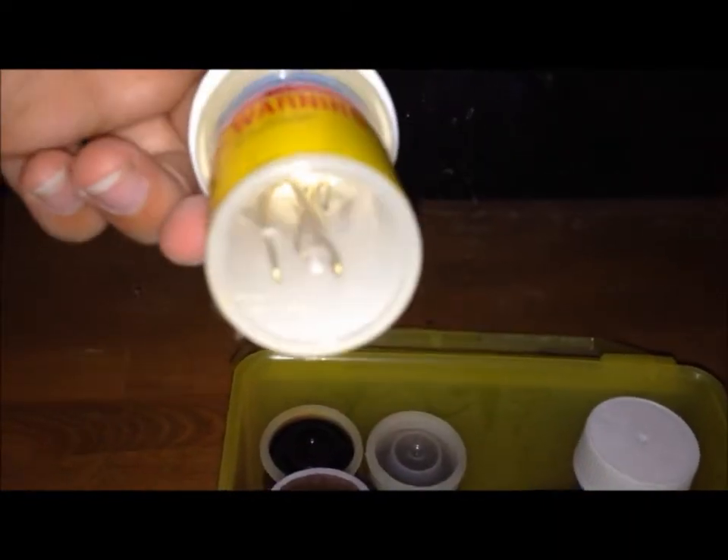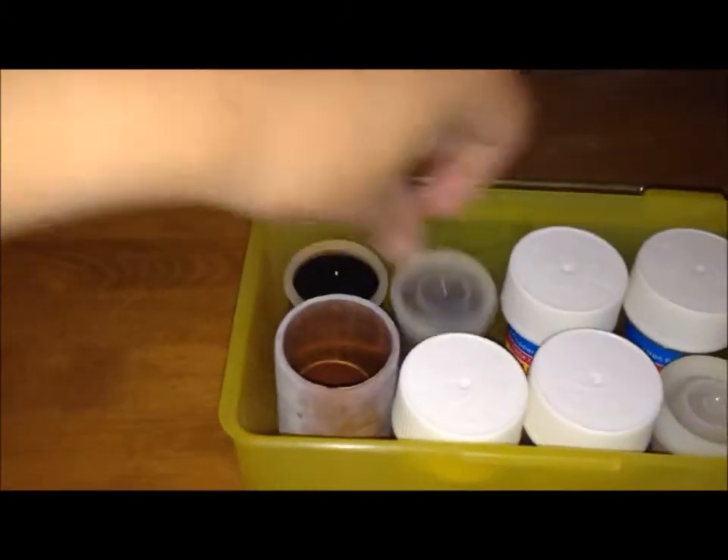Iron filings, copper, copper foil. Carbon — this is just a little bit of carbon I got from sugar.